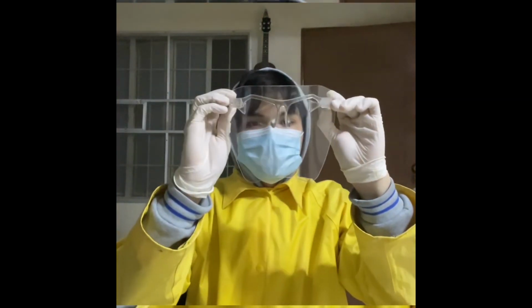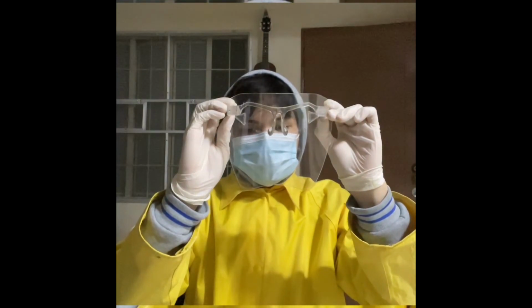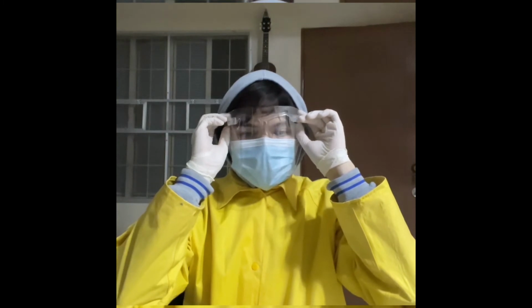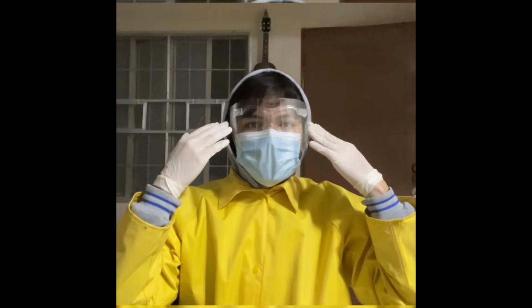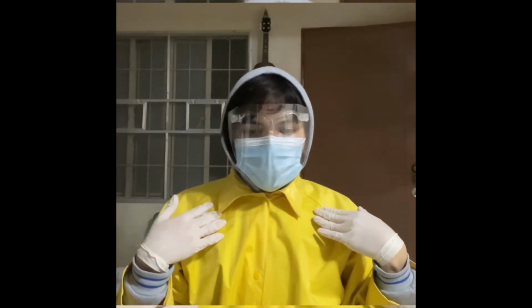The advantage of using a face shield is that it is widely available, especially now, and it does the purpose of protecting the handler from potential splashes and contaminated fluid. However, its disadvantage is that it only covers a majority of the face. In biosafety level 2, it is recommended that the face protection covers until the neck of the handler.